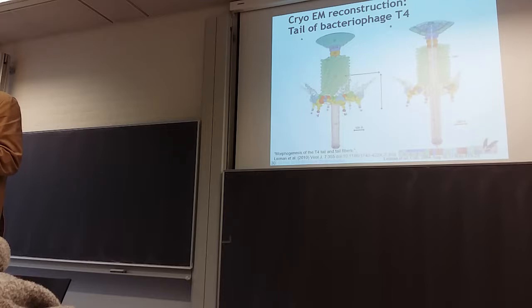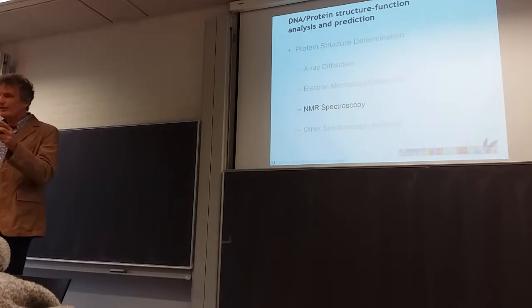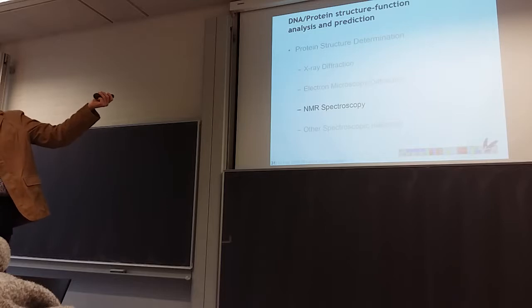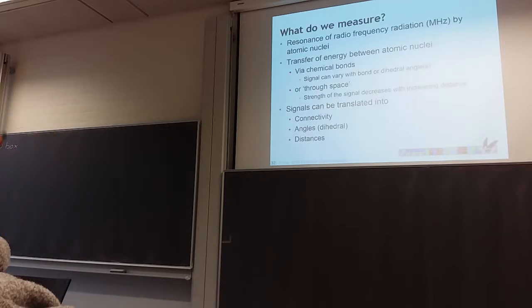No? Okay. Then we go on to NMR. As I said, the EM is the most direct way to get structural information because it's really microscopy. X-rays is indirect in the way that I've already explained. NMR, I also already sort of mentioned how that works. We'll go into a little bit more detail right now.